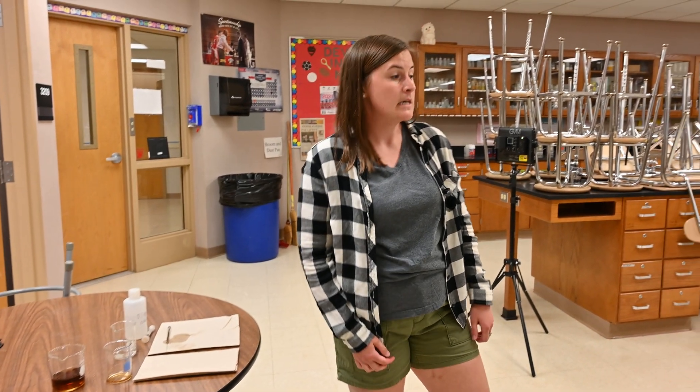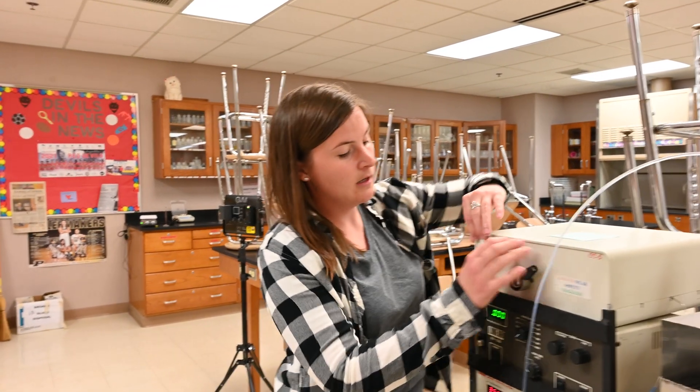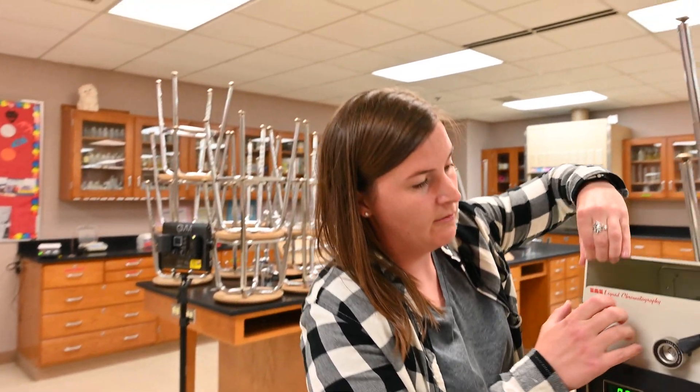Before we get there though, I want to show you a little bit of what's happening behind the scenes. So in our HPLC over here, it stands for high pressure liquid chromatography.